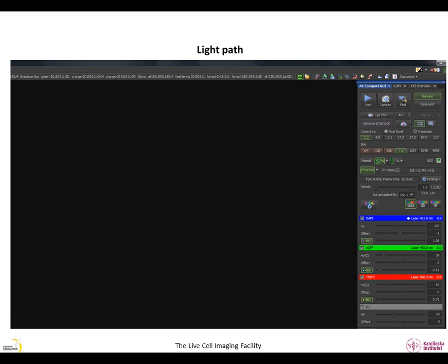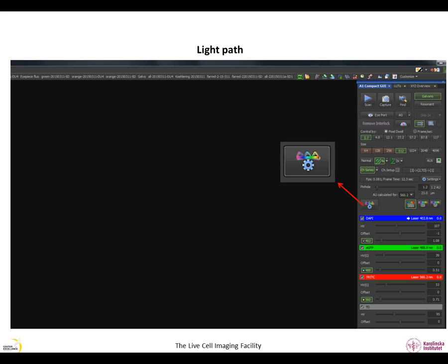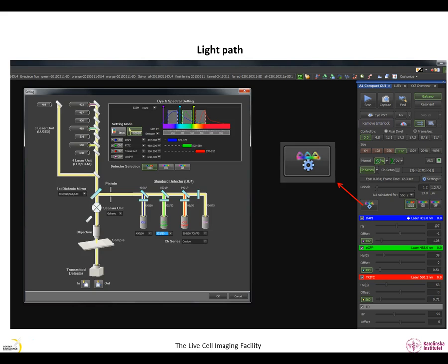Let's assume that you find a region of interest within your sample and you would like to start imaging. Before you do this, you need to select the appropriate lasers and filters for your sample. This is done in the light path window, which you can find by clicking on this button. A new image window will pop up containing all information regarding lasers, dichroic mirrors and filters.